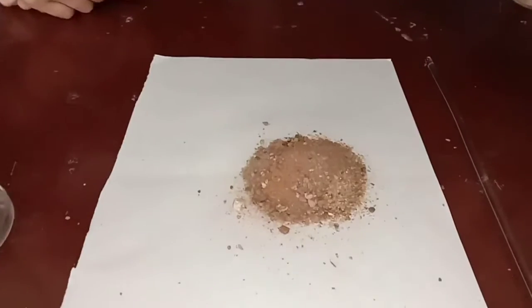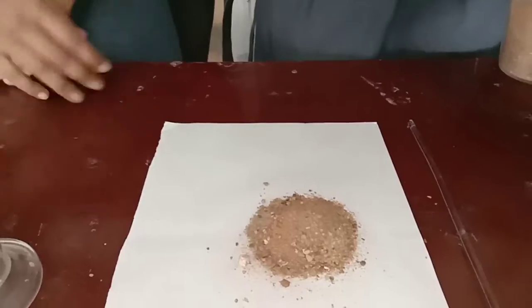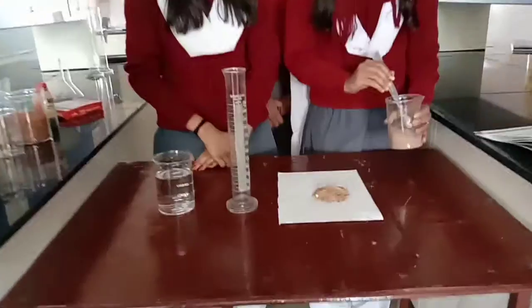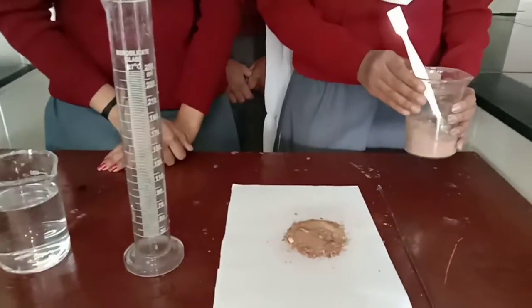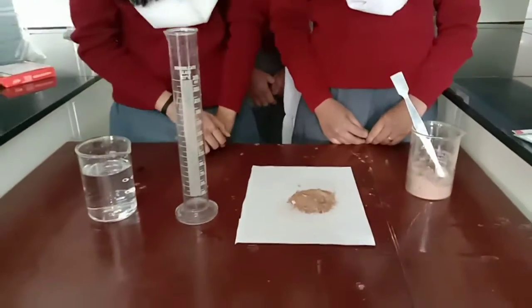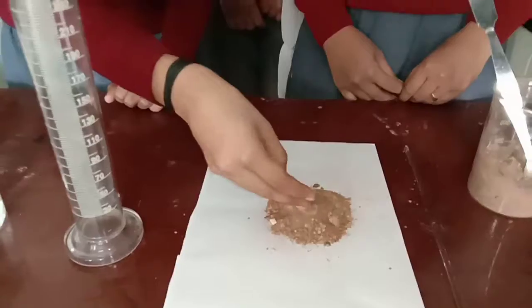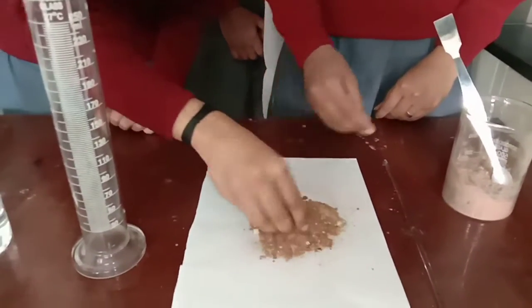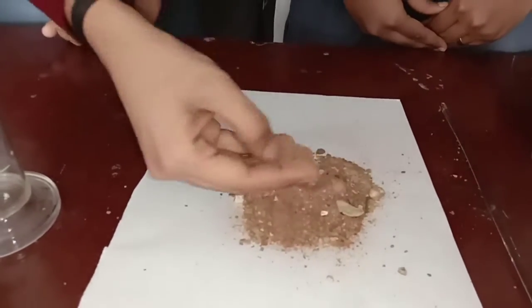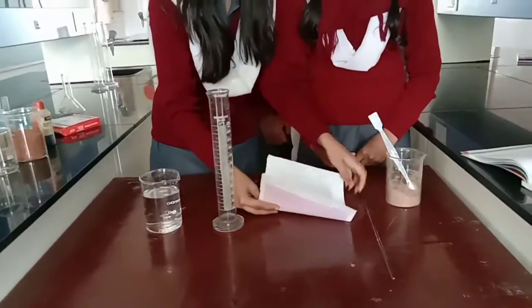Now the procedure. With the help of a spatula, we have taken 2 or 3 tablespoons of soil sample on this sheet of paper. We can touch it with our hand and feel it, and we can see the texture of the soil. By just holding it in our hand, we can see the texture of the soil. It has sand, pebbles, clay.